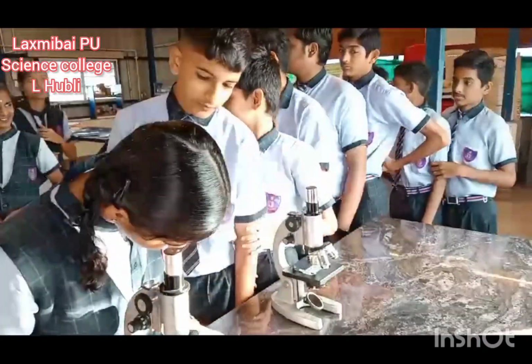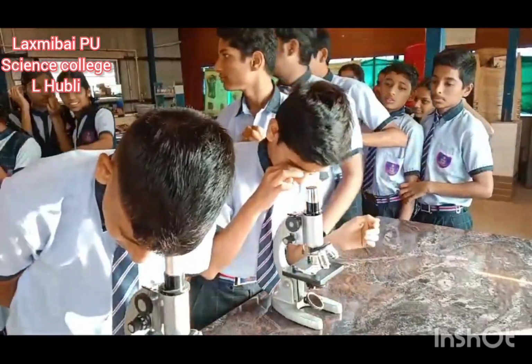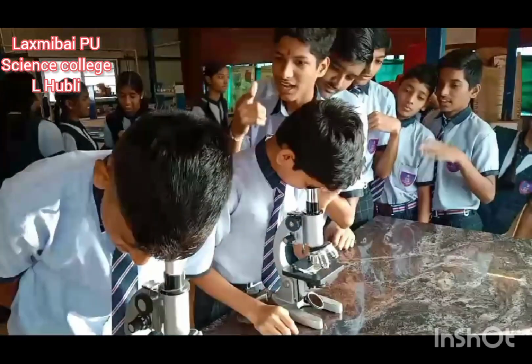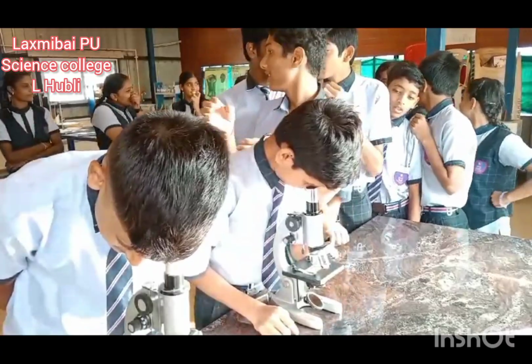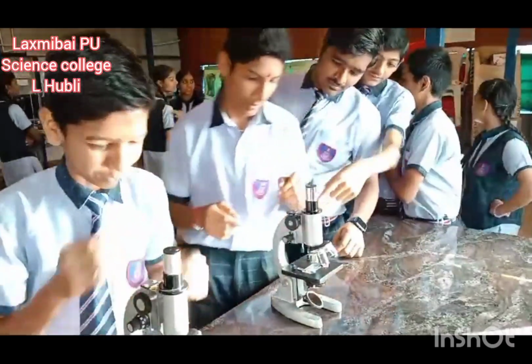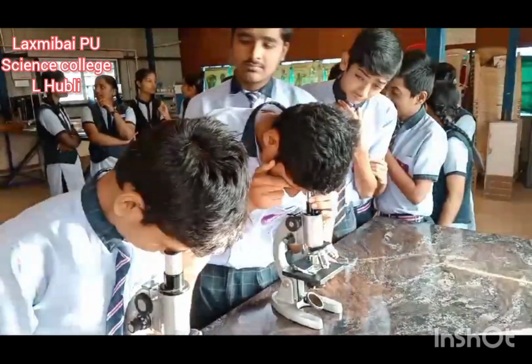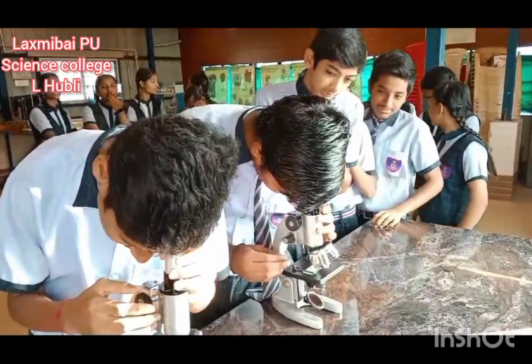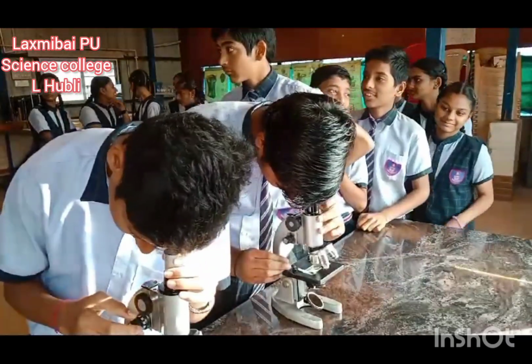The small one you can adjust. This one is more. Now you can see clearly. First observe it. Don't touch. Correct?